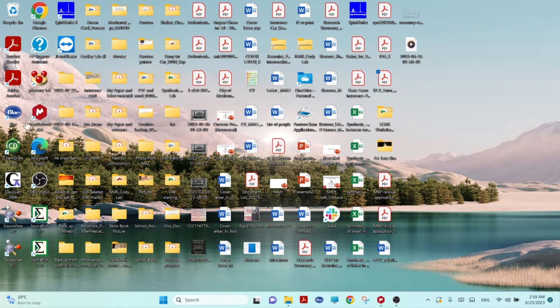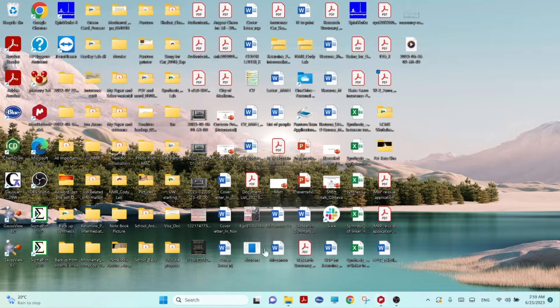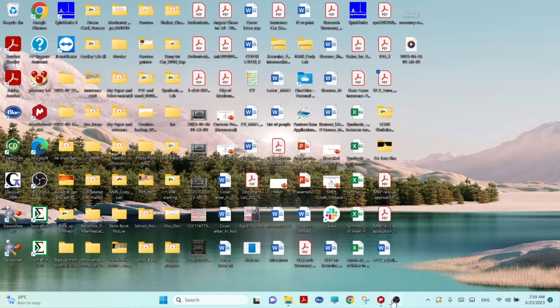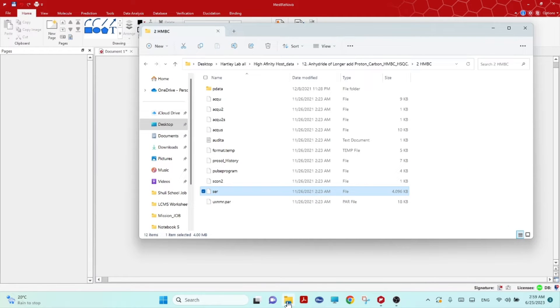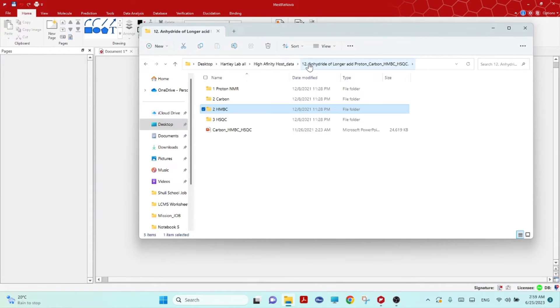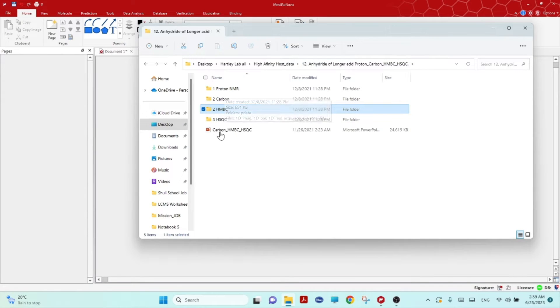Here is the software icon. You have to install this software and once you install it, then you can open the software and you have to have the NMR files location. Remember, whatever HSQC you want to open, make sure that of the same compound you have the 1D Proton NMR and also 1D Carbon NMR.